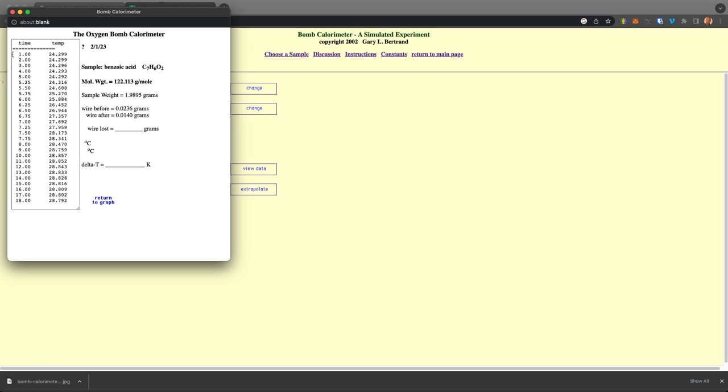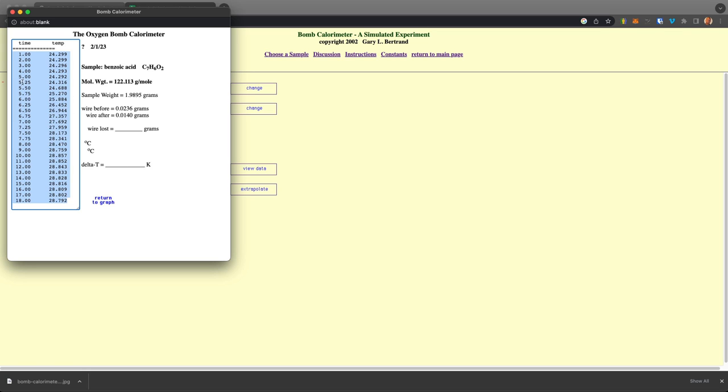And we can even take this data right here and copy it to a text file or copy it into Excel or a spreadsheet or a graphing thing. And this is representative of actual data you would get from a realistic bomb calorimeter like that one I showed you before.